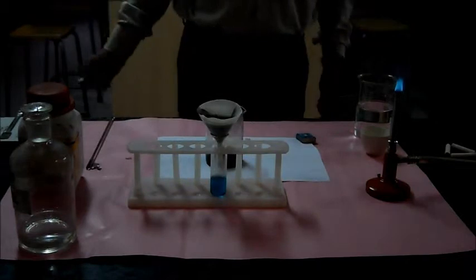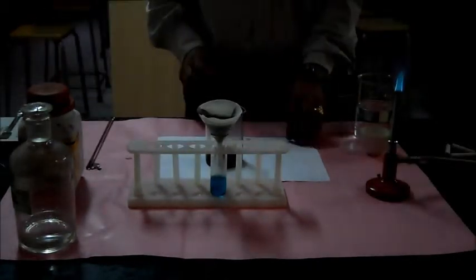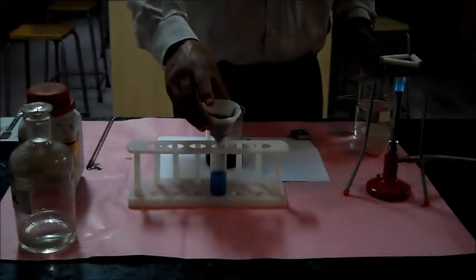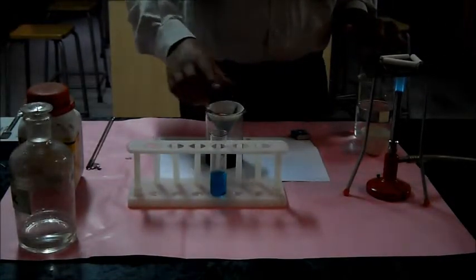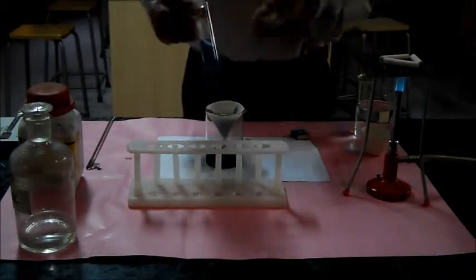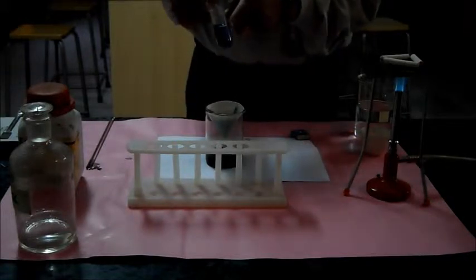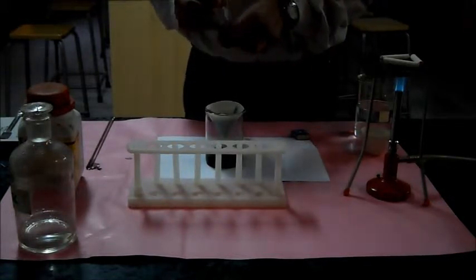For heating, I have got here Bunsen burner. I will be using this fire gauge over it for drying up. As you could see, the blue color solution is due to the presence of copper sulfate in it, which is a blue color salt.